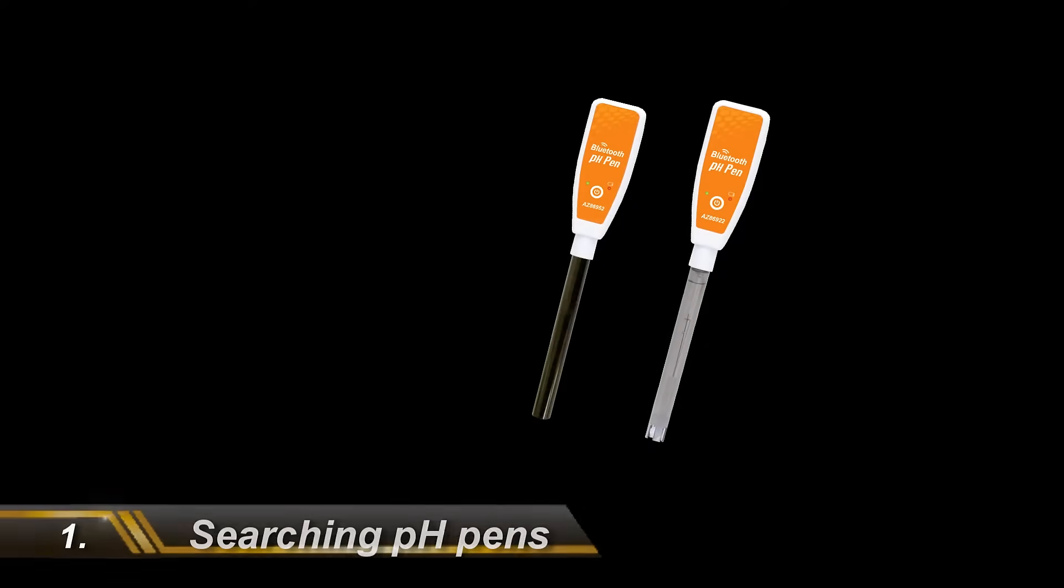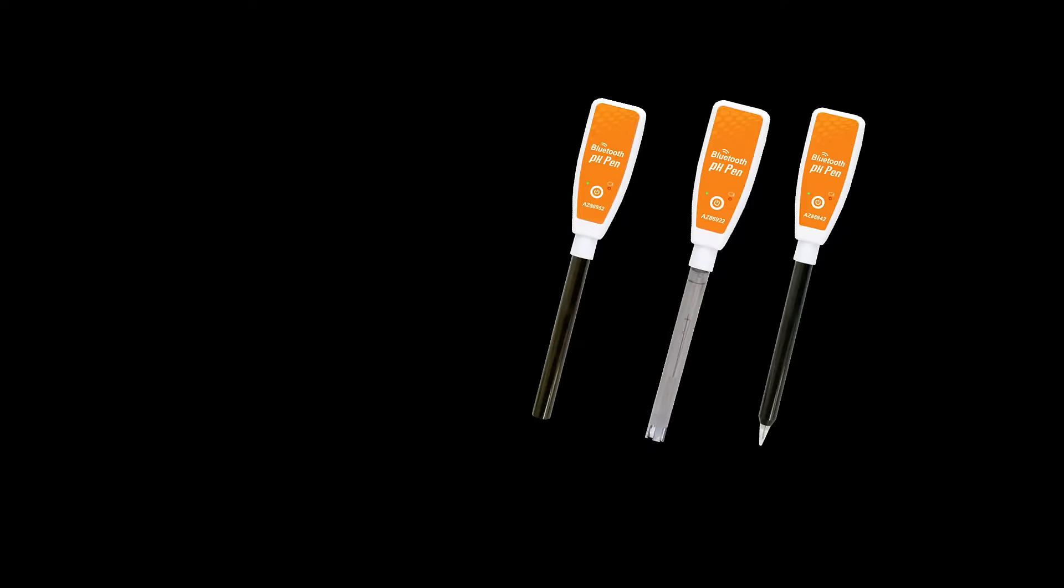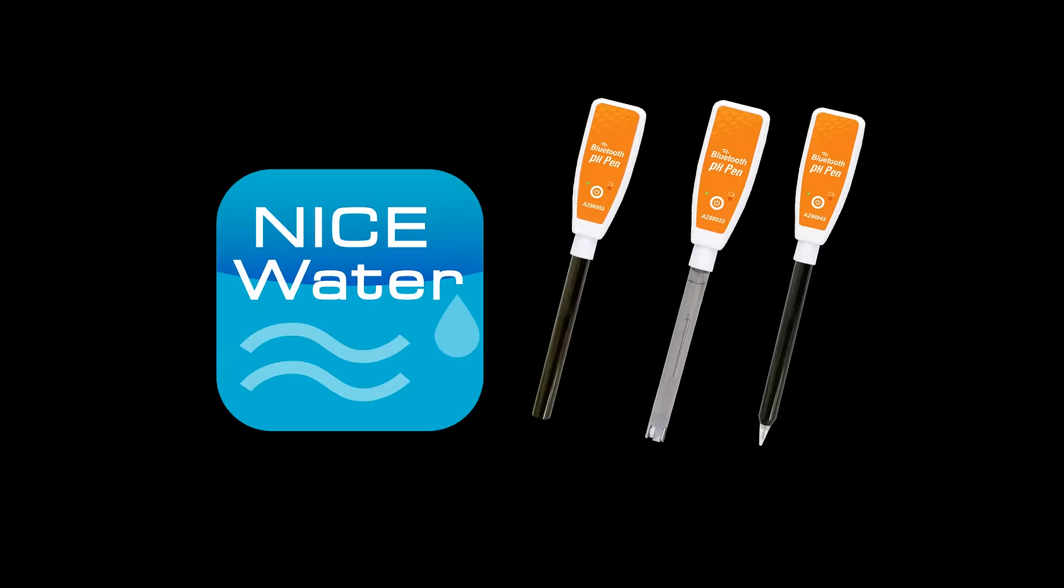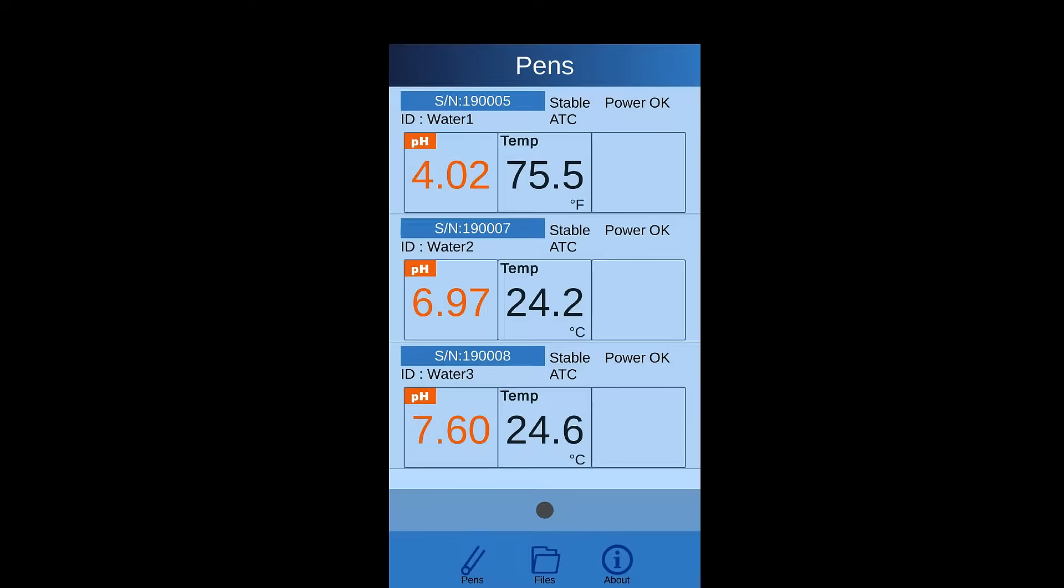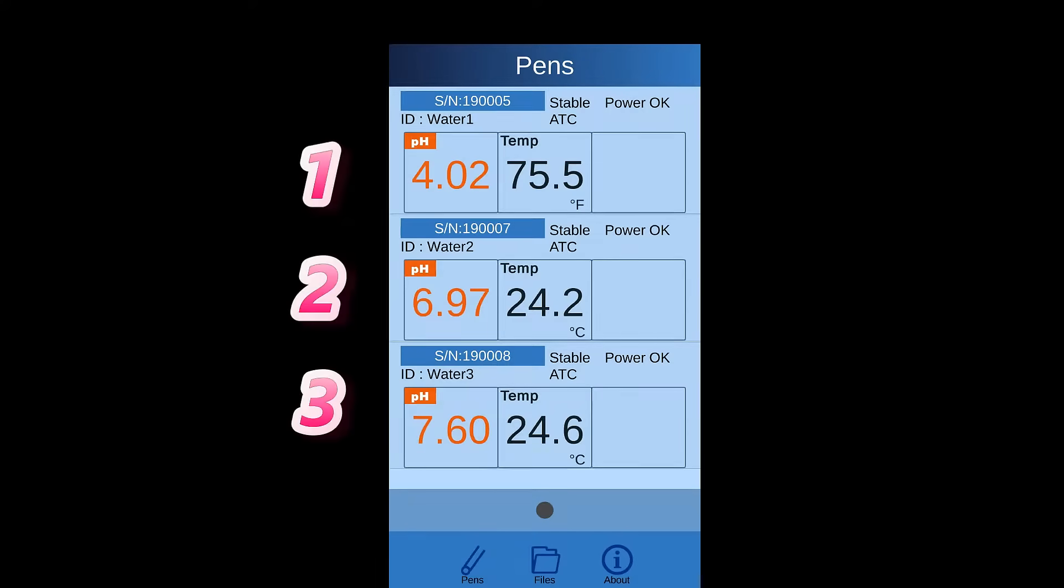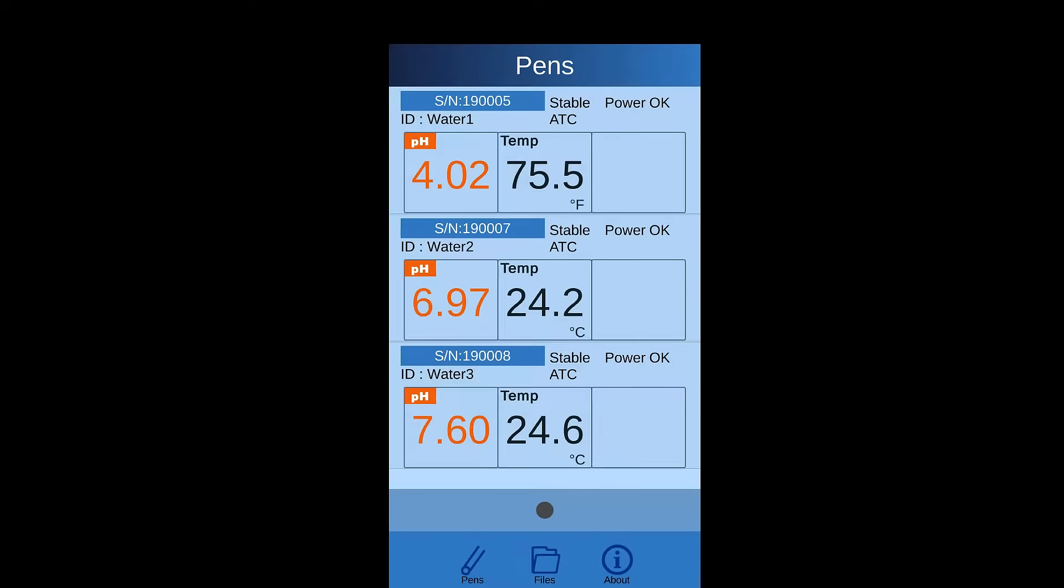Power on the PH Pens and turn on the Nice Water app. The app will automatically scan the available devices around you. Maximum 3 devices value will be displayed in one main page.